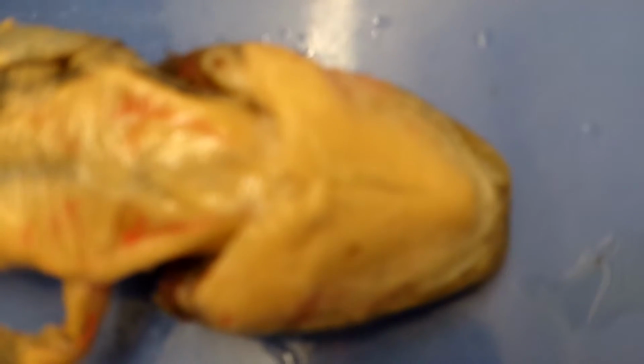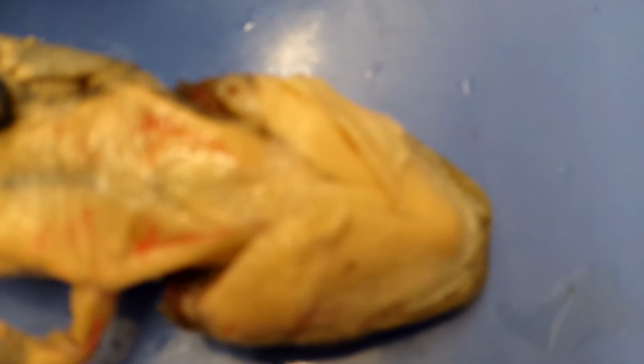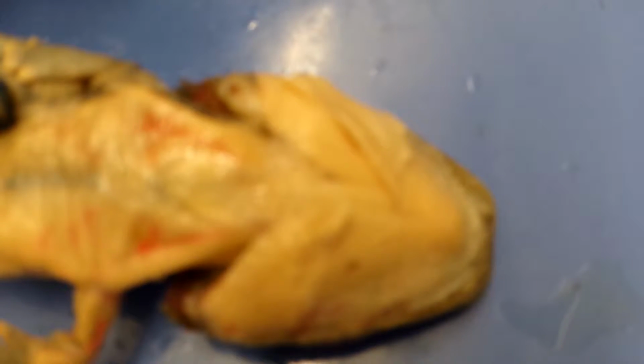The next is the interhyoideus, which is found on the underside of the intermandibularis, right here. Its origin is the fascia of the depressor mandibulae and branchiohyoideus, and its insertion is the median raphe.